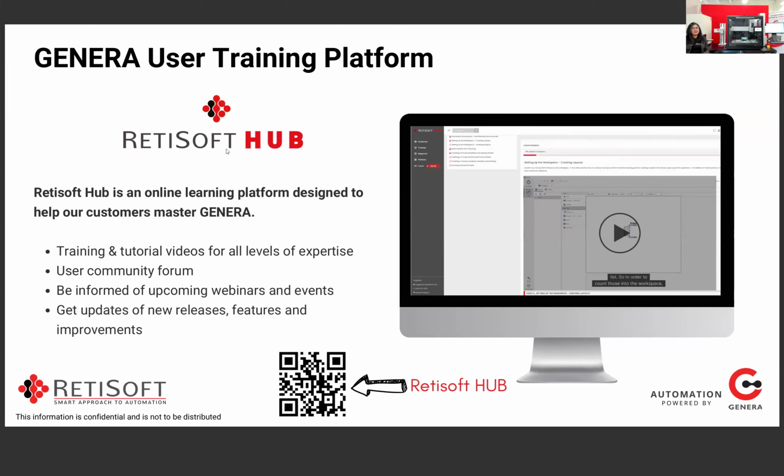Yep, so as I mentioned, this is our Retisoft Hub. This is our online training platform for users to master Genera. In this Retisoft Hub, we have training and tutorial videos for all levels of expertise. We have a user community forum where users can interact with each other and ask any questions, and other users can answer them. You could be informed of upcoming webinars like this one and other events, and get updates on new releases, features, and improvements as we're actively creating new releases, fixing bugs and creating new features.